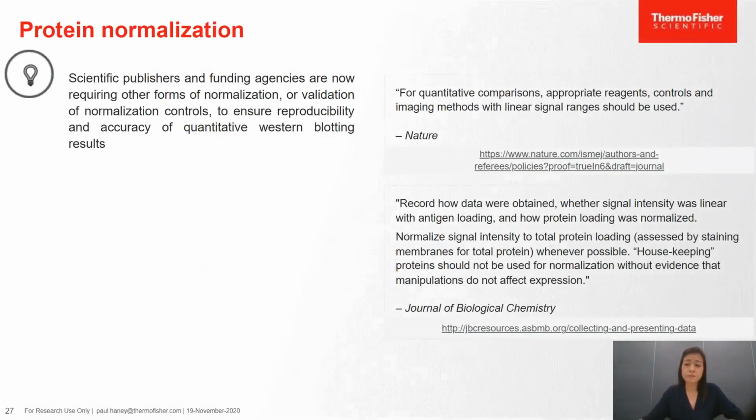Another consideration when performing quantitative Western blotting is protein normalization. Scientific publishers and funding agencies are now requiring other forms of normalization or validation of normalization controls to ensure reproducibility and accuracy of quantitative Western blotting results.